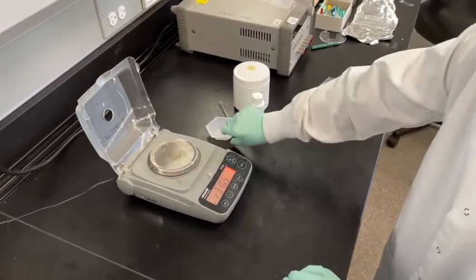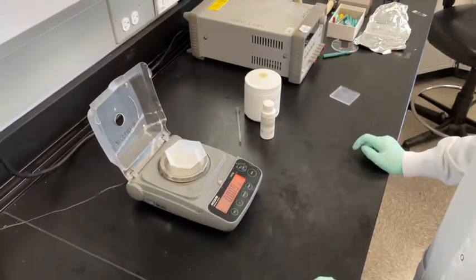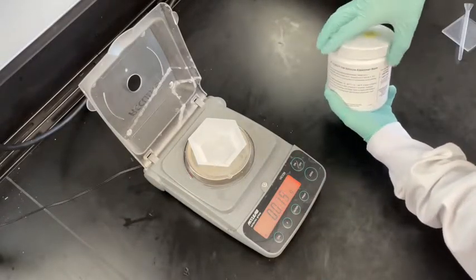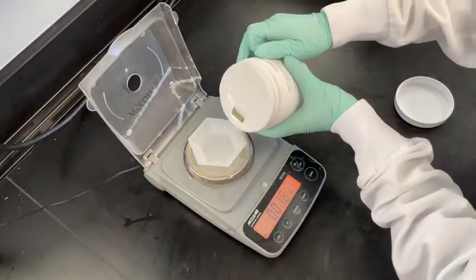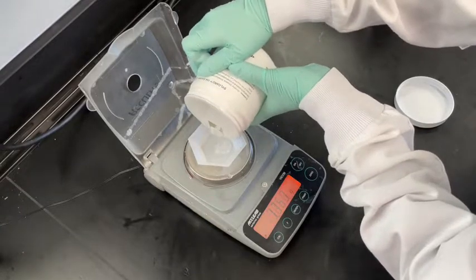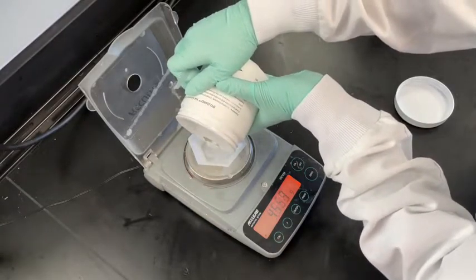The first step of PDMS chip fabrication consists of preparing the PDMS mixture. Using one of our lab's digital scales, place a weighing boat on the scale, then tare the scale. Pour approximately 10 grams of Sylgard PDMS 184 silicone elastomer base into the weighing boat. Adjust the amount of PDMS according to your design.